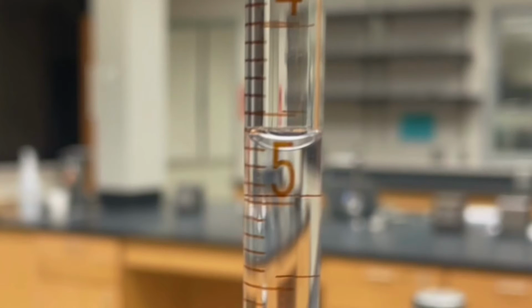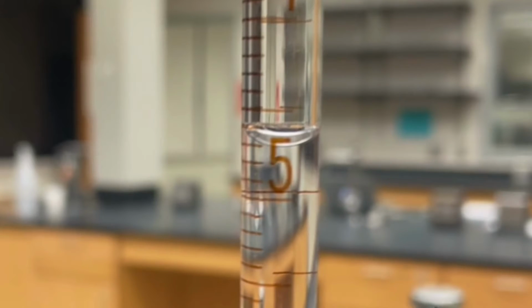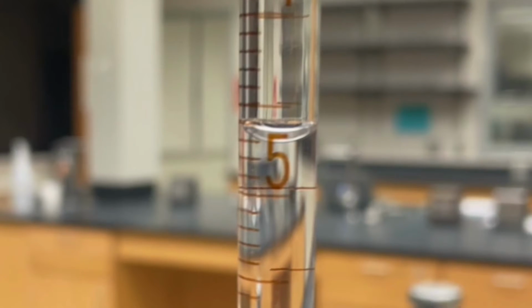For those that aren't familiar with the concept of measuring volumes with a meniscus, here's a brief explanation. A meniscus is a small bowl-shaped dimple that appears on the surface of liquids when they are surrounded by a container. This phenomenon occurs because of the forces of adhesion and cohesion battling one another. In the case of a meniscus, the adhesion force wins out as the liquid's molecules are more strongly attracted to the walls of the container than they are to each other.